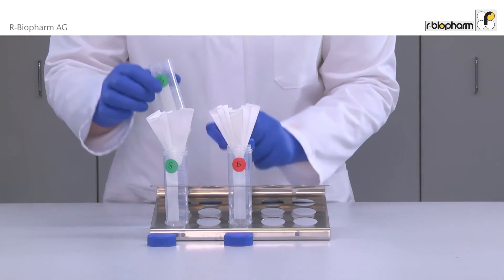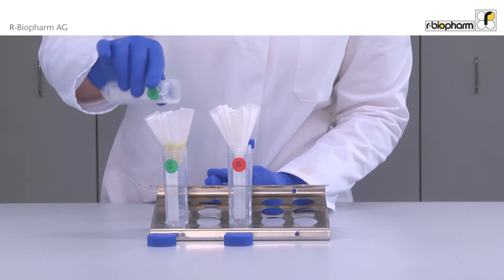Filter the sample extract. Use the clear filtrate for analysis with the Reader Quick Sawyer.